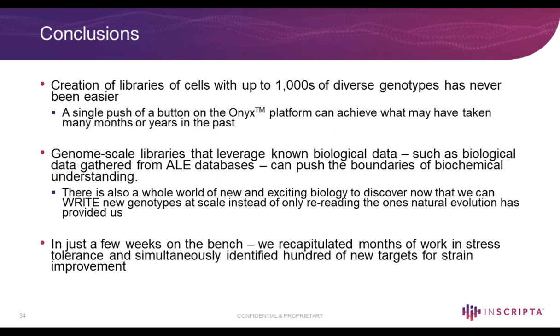In this particular study, we showed that we can recapitulate the ALE study using modifications that were found within previous ALE experiments, but this also showcases the ability to take that engineered population, with precisely what's in there, and carry that forward for subsequent ALE experiments or subsequent Onyx editing experiments to be able to combinatorially edit in the future.